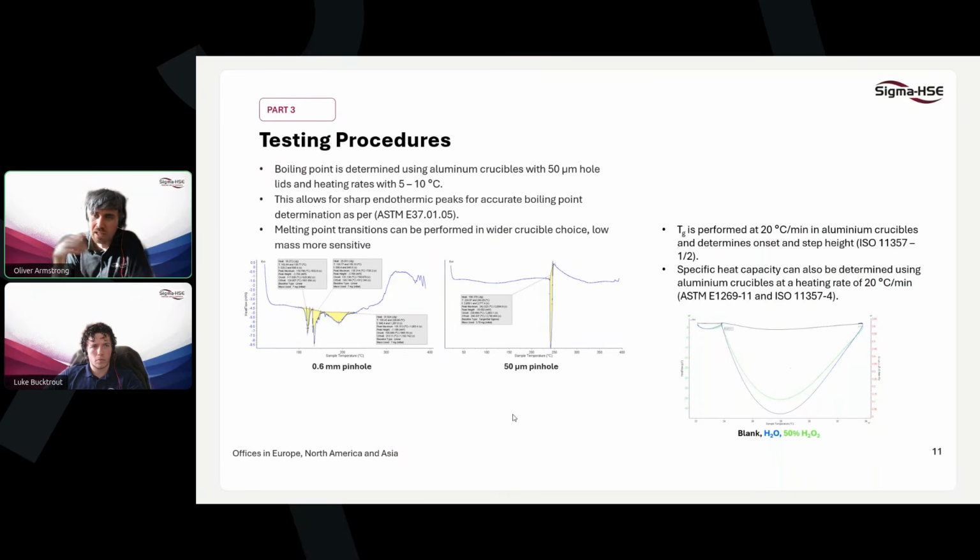This organic liquid, it is not uncommon for organic liquids to experience decomposition immediately after vaporization or very quickly after. So it's a potential for this sample that it's vaporized very cleanly using the correct pinhole.